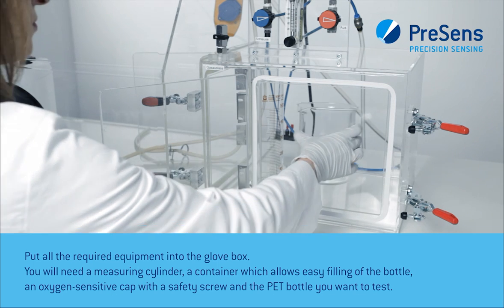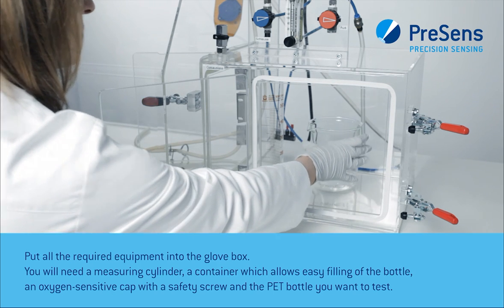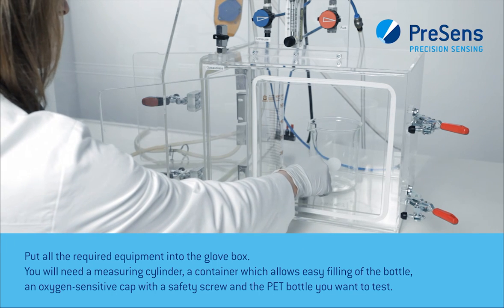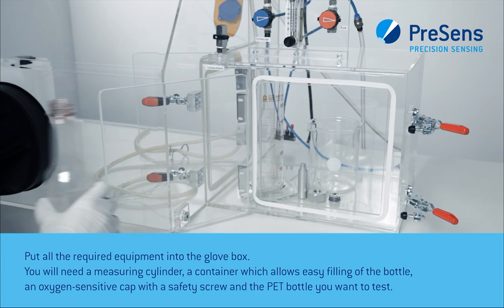You will need a measuring cylinder, a container which allows easy filling of the bottle, an oxygen-sensitive cap with a safety screw, and the PET bottle you want to test.